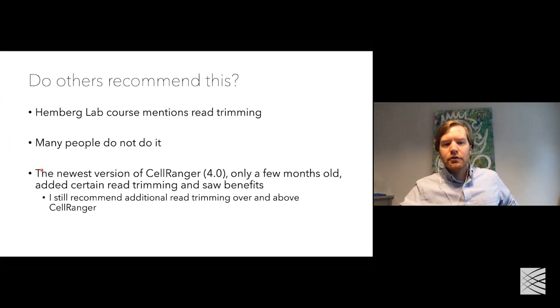And in fact, the newest version of the Cell Ranger software, which is a software put out by 10x Genomics, it's very convenient for creating count matrix data. The newest version, only a few months old, did add certain read trimming and saw great benefits of this procedure.